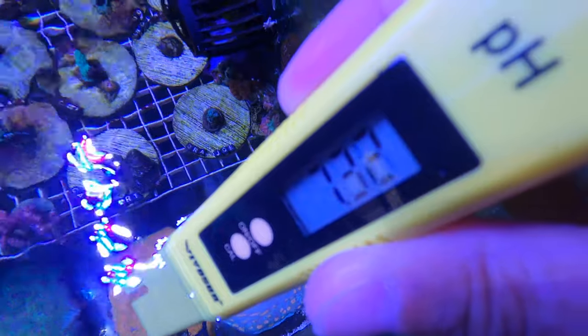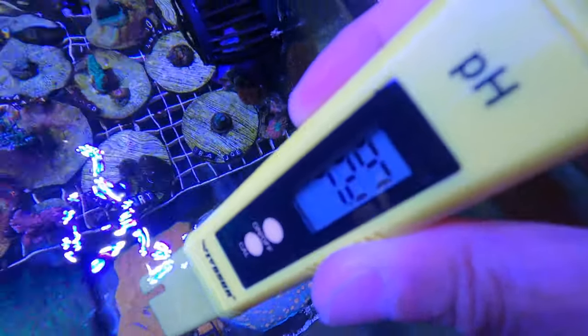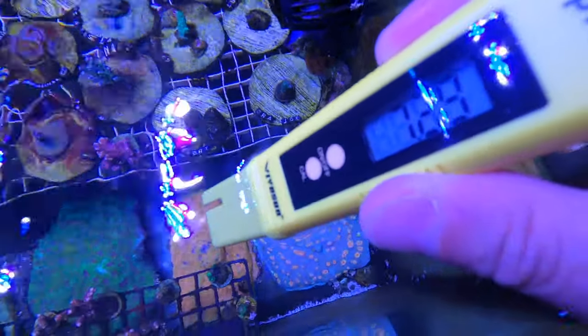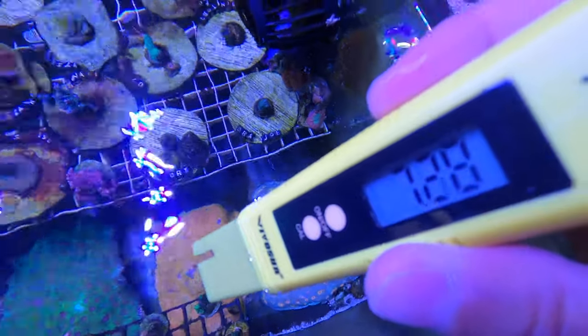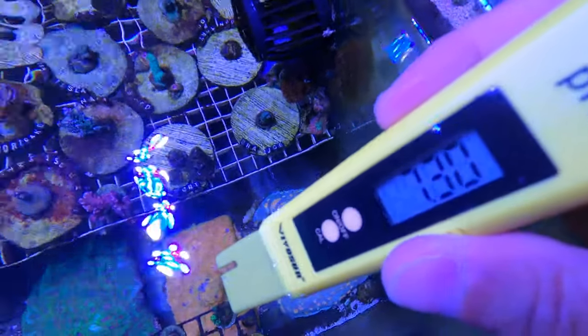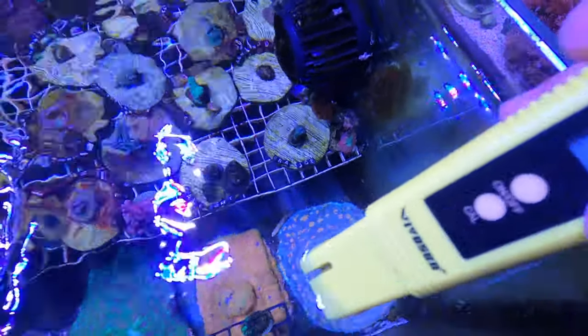Holy moly, that pH is low. After this test I'm going to run a manual test to see how accurate this thing is. Now let me test the TDS meter and see how that works.